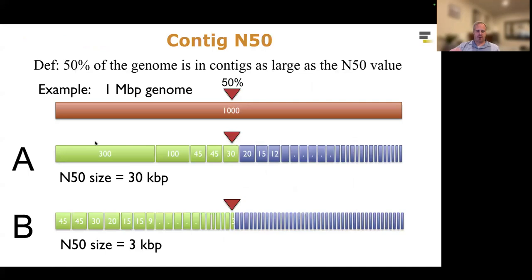So in this process, we're going to start from this very simple graph at the level of individual k-mers. We'll grow up these longer sequences as far as we can.